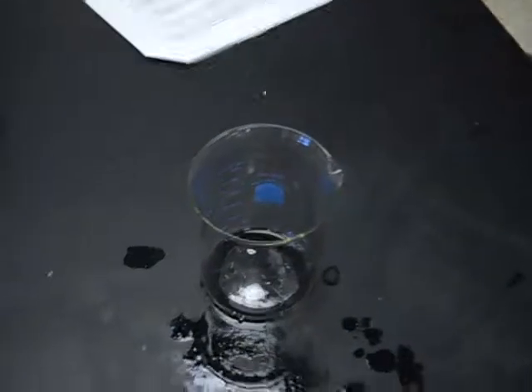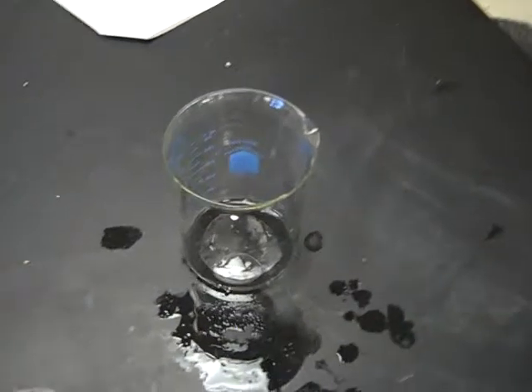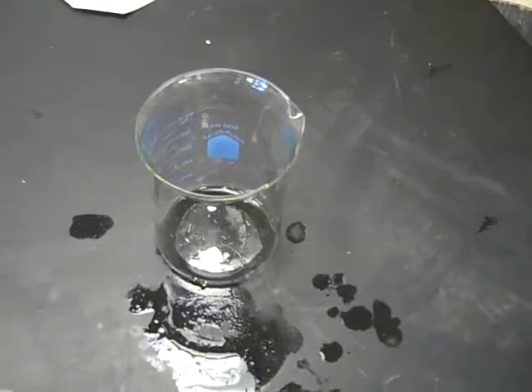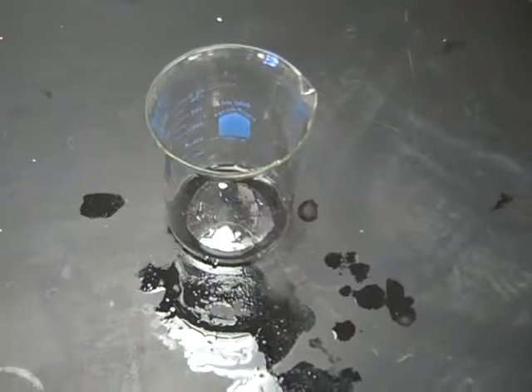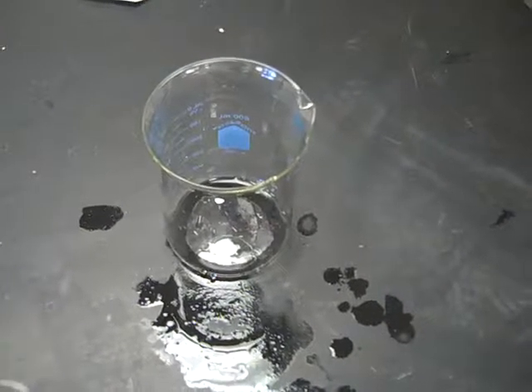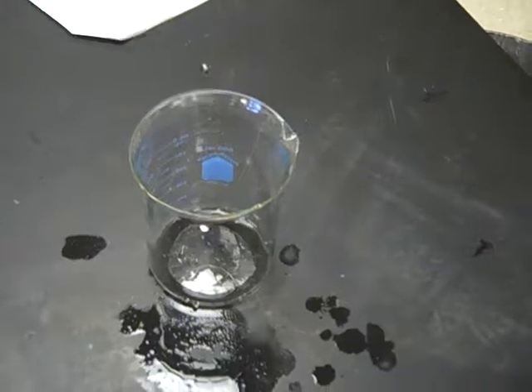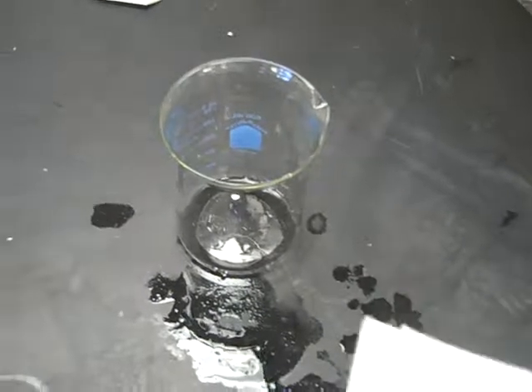Okay, for station 10, which I'm not able to show you at this moment, what we did is this beaker here had salt water in it. And then we took a test tube with just a little bit of tap water and put it down inside the ice bath for 2 to 3 minutes and assessed if putting the water into a saltwater bath would be an example of a physical or chemical change.